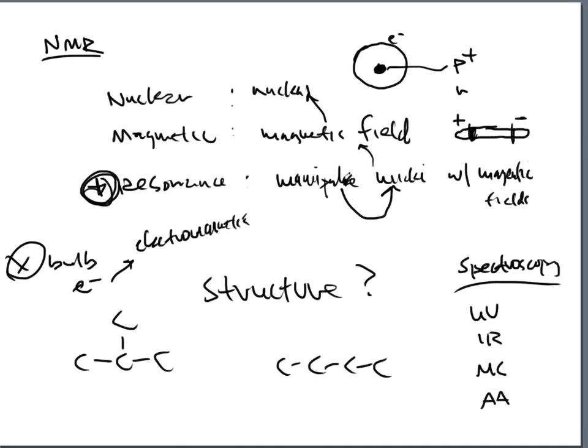And when we talked about the electromagnetic spectrum in a general chemistry course, we have often talked about the entire gamut. So we have a visible region that your little bitty eyeballs can see. Red, orange, yellow, green, blue, indigo, violet. And then there's a UV portion, and then there's an infrared portion, and that's where those kind of electron energies come from in a way. But there's also more to the story than that.